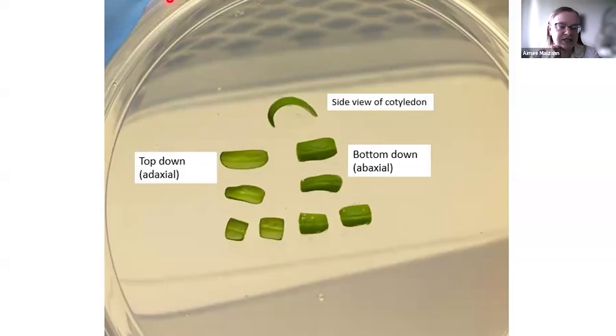So the problem is that their tomato seeds germinate at different speeds. So what is the best way to synchronize the germination of the tomato plants? So your recommendation would be an overnight soak in water. That's what I've heard has worked. I mean, we haven't had to try that really ourselves.